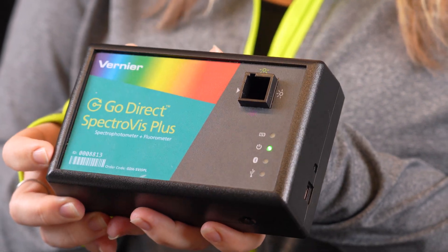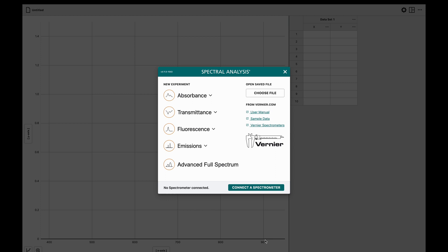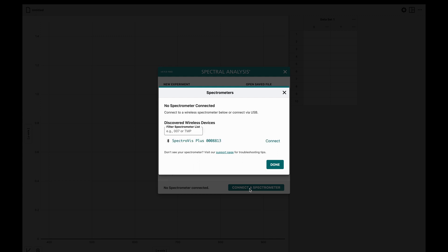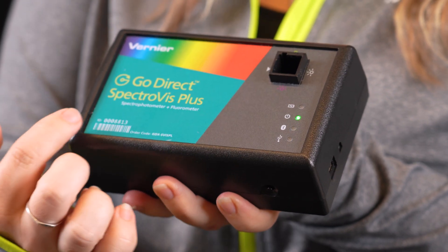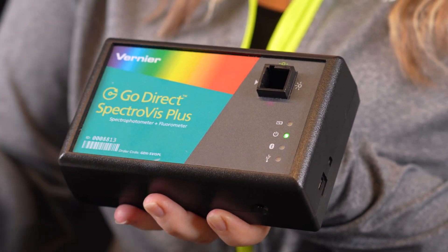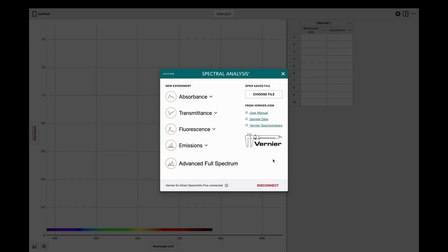I turn on my spectrometer by pressing the power button once. The Bluetooth LED will blink. If you're using this spectrometer with Spectral Analysis, click or tap Connect a Spectrometer. Select your GoDirect SpectraViz Plus from the list of discovered wireless devices by matching the serial number on the label with the one from the list. Click or tap Done to enter data collection mode.